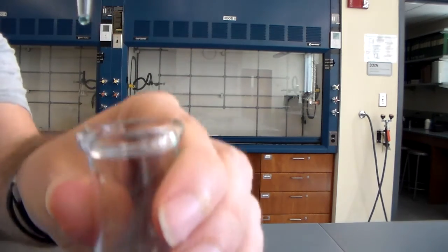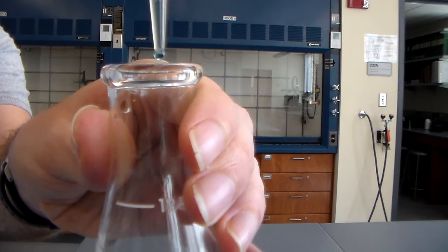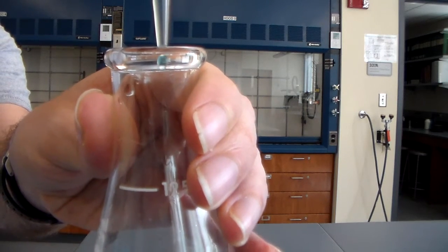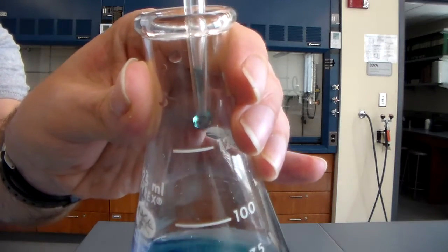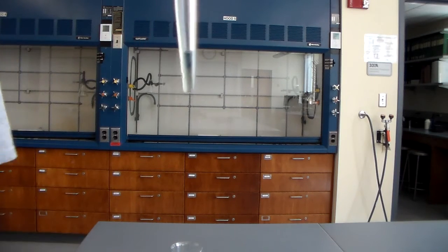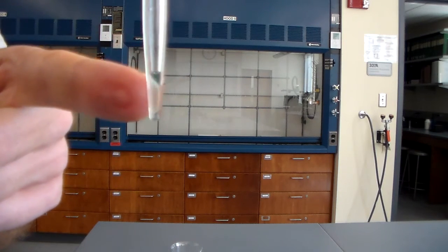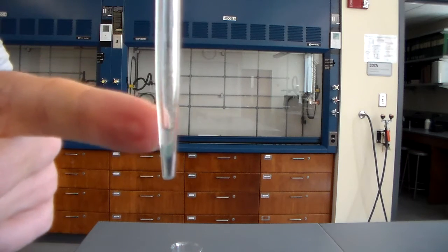So obviously you won't always have this over your container, not in front of the camera, but then just let it drip out. And then when that final drop actually comes, just touch it to the side of your container and just let it fall in. All right. Now at this point, you'll notice that there's still a little bit of liquid left in there. We don't want to go and blow that out, even though you're going to be very, very tempted to.